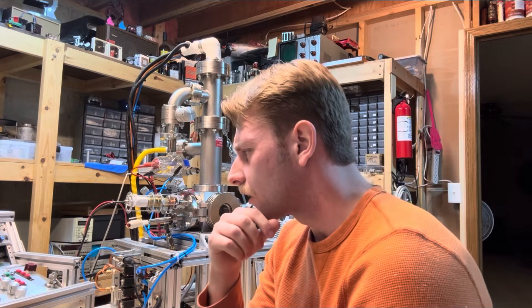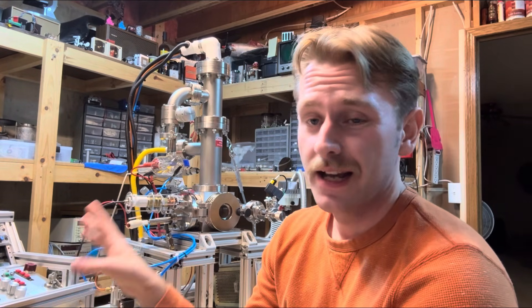There's a lot more. I think I'll cover it in another video. Because it's going to have a lot to do with the mainframe here. And that's not done. And there's a lot to be said about it. So, that's that.